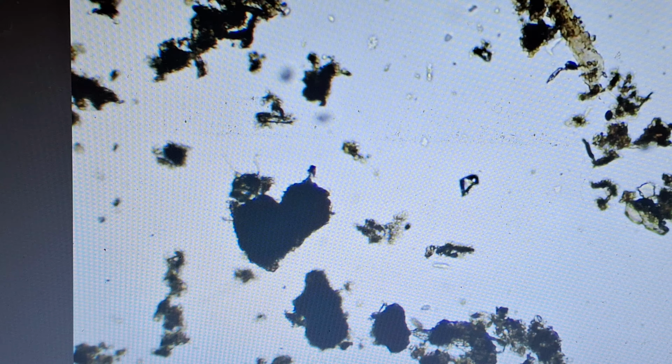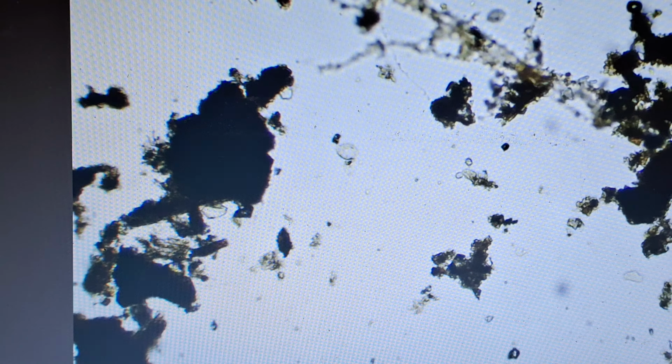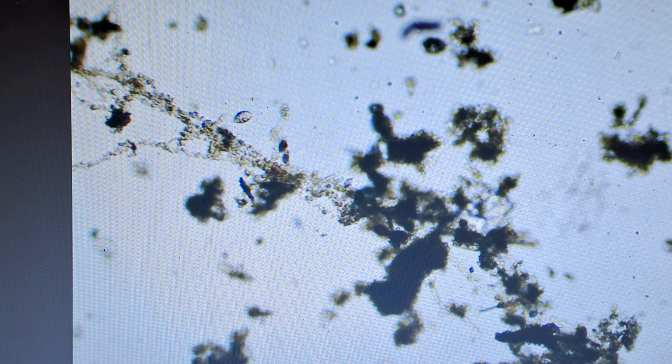Where did they go? You see how things are patched up more into chunks? And see the bacteria get all clumped up. We'll look at that more when we zoom in.